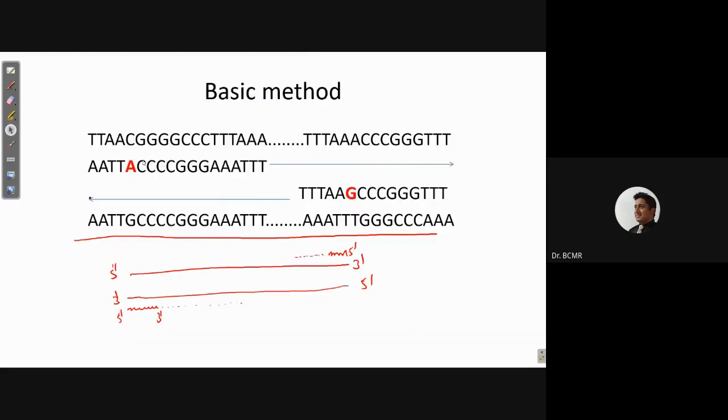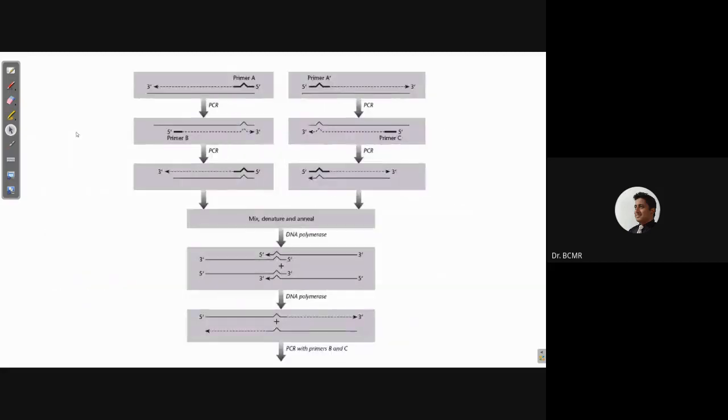So the one that is represented here is, I think, the primer extension method. I will leave that there. And I'm going to discuss site-directed mutagenesis. Anytime we are trying to perform an experiment or study a protocol, it's important to know the objectives of it. Only then are we able to follow it through the way it should be.